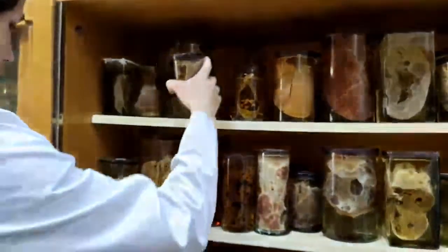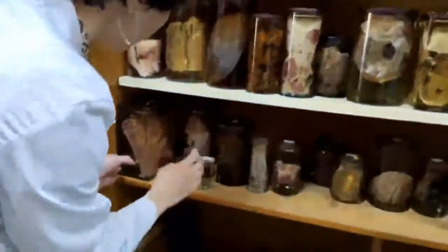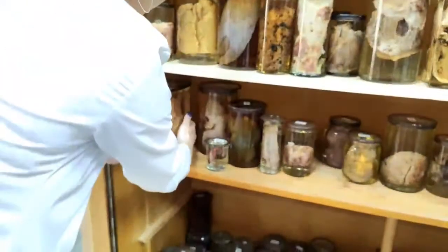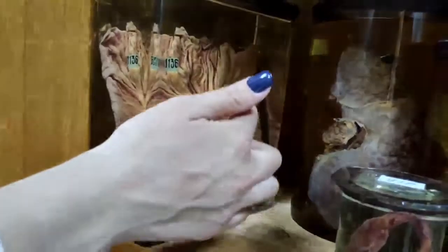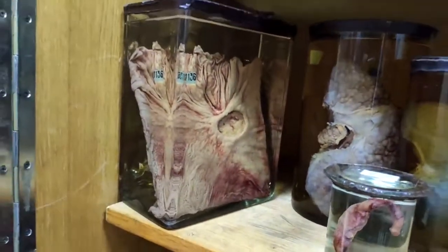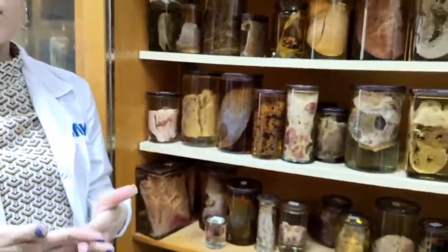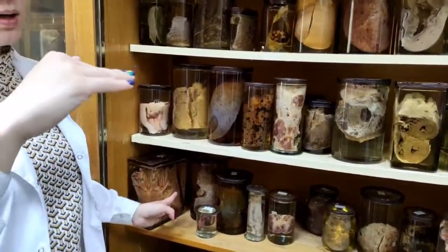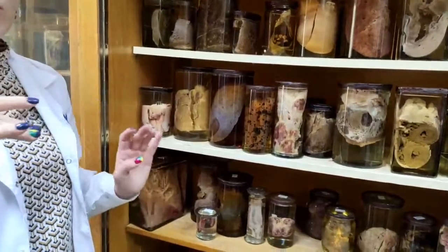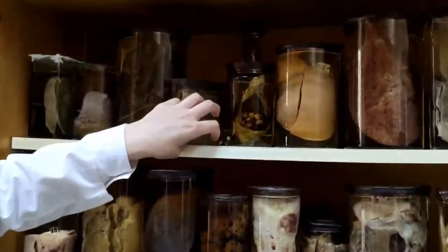And I will show you one more specimen now, this one, because it's also stomach. You can see the mucosa, and you can see this big hole. It's an endophytic lesion, and this is an ulcer. It's very important to differentiate between erosion and ulcer. What is the difference between erosion and ulcer? An ulcer is a lesion deeper than the muscularis mucosa. When the muscularis mucosa is not involved, this is erosion, and erosion is characterized by this hydrochloric hematin.